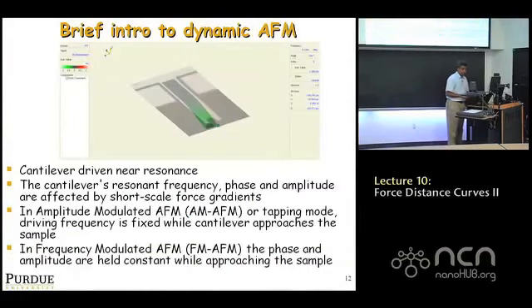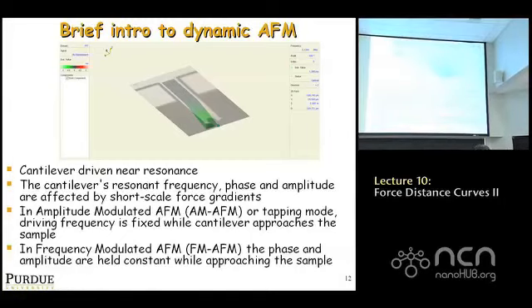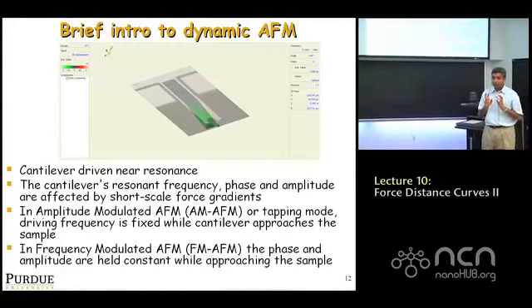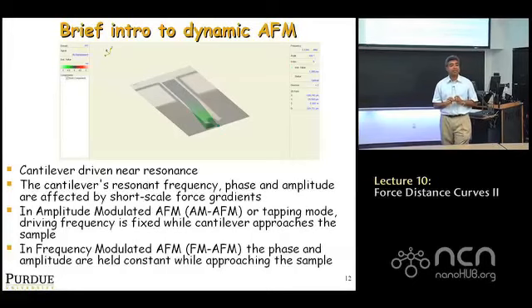Okay, so we're going to have about 3 lectures dealing with dynamic AFM, but for now, this is just a brief intro, and we need to do this before the next class, which is on calibration methods, because many calibration methods use dynamic properties of cantilevers, okay? But basically, you go back to a lecture 2 lectures ago where we talked about, you have a cantilever, you apply a point force, the cantilever bends, and the equation of the bent curve is, anyone remember?